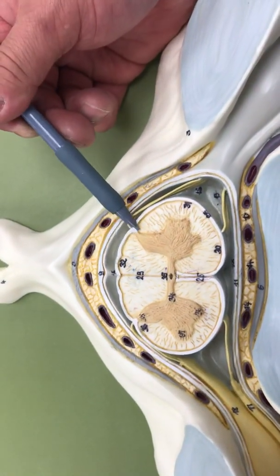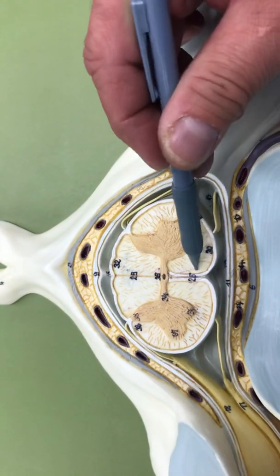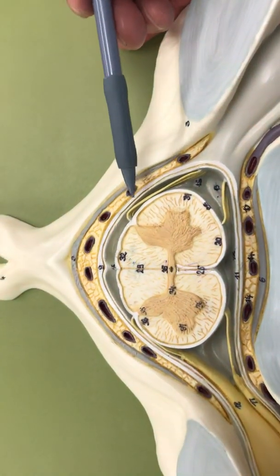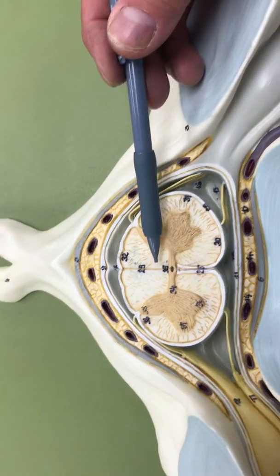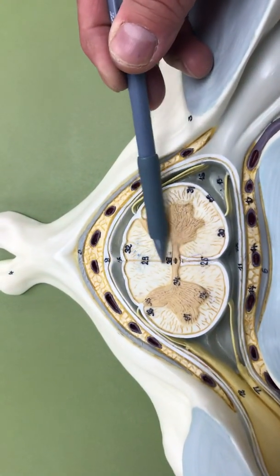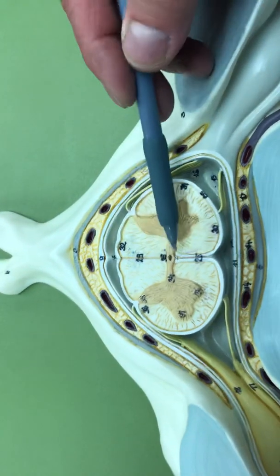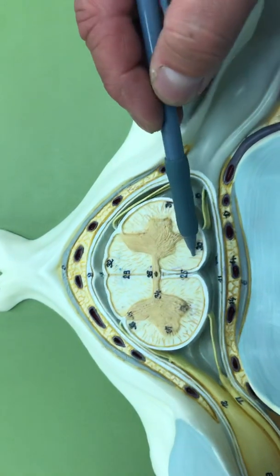The most intimate and the deepest of our meningeal layers is the pia mater, and that's what we see as the white external outline covering the spinal cord itself. The spinal cord, like the brain, is split in half. Where the brain has one longitudinal fissure, the spinal cord has two different segments. One is the posterior median sulcus, separating the two parts of the posterior column. Then you have the anterior median fissure, separating the anterior column right here.